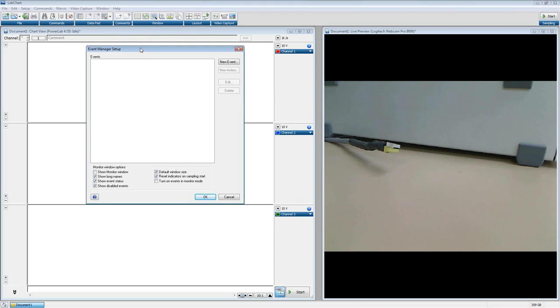Not very exciting looking window here. It's empty. And the way Event Manager works is we can define events and we can link actions to these events. You'll see here, new event. The event is the root of everything that's going to happen here. Basically, we're going to build a little outline out here, and we'll show the different flow of how our events work and what actions they actually turn on or off.